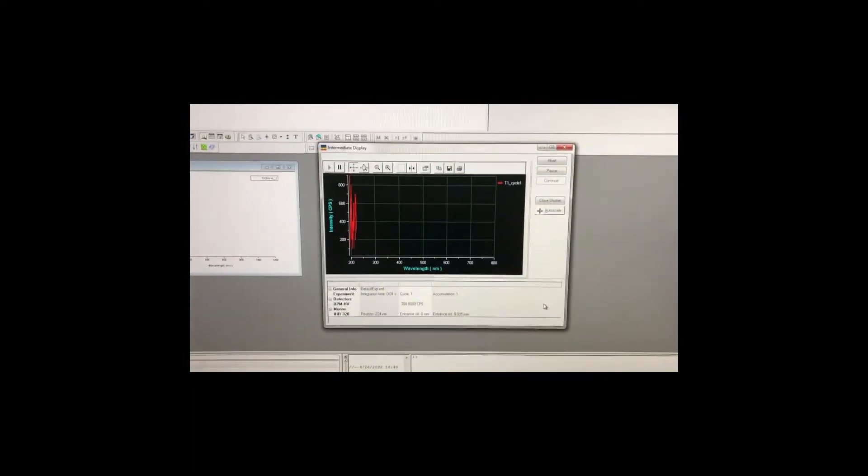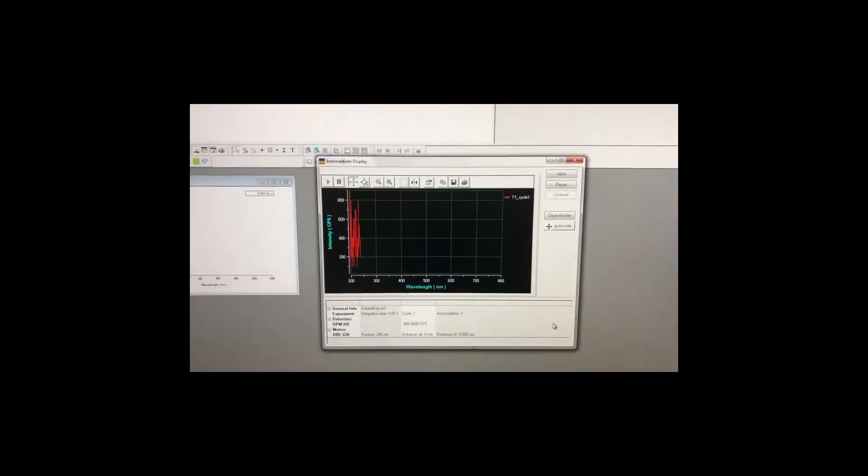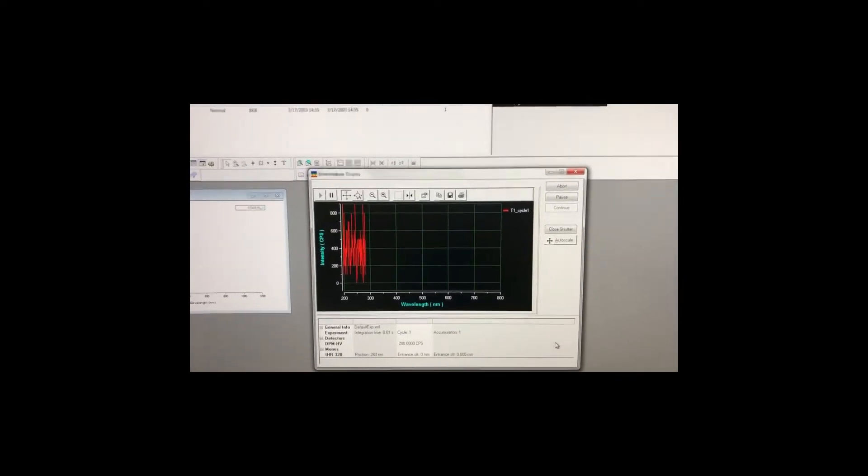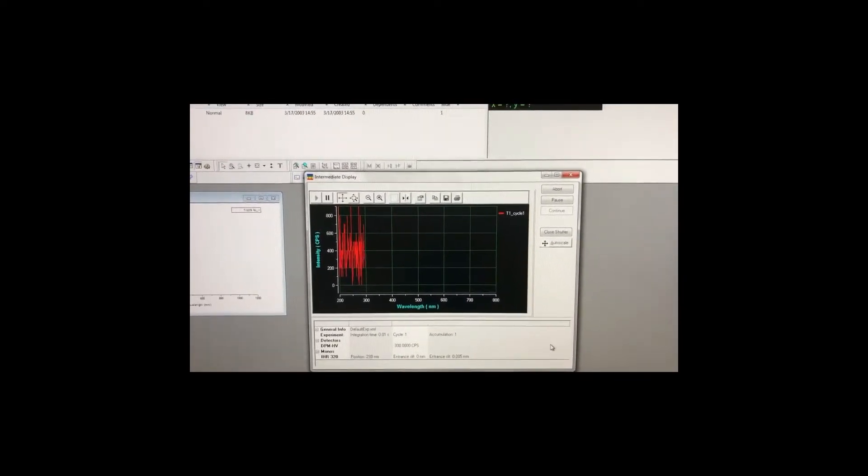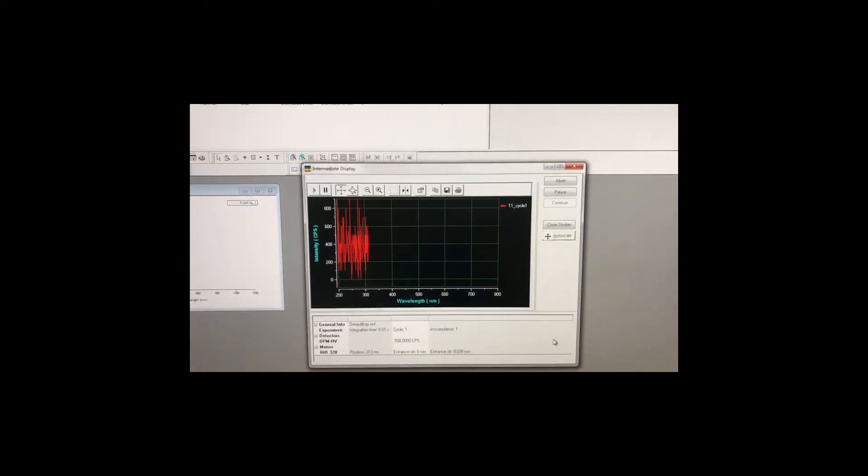Right now we are running the Horiba machine to measure from 200 nanometer wavelength to 800 nanometer wavelength. So let's wait for a while.